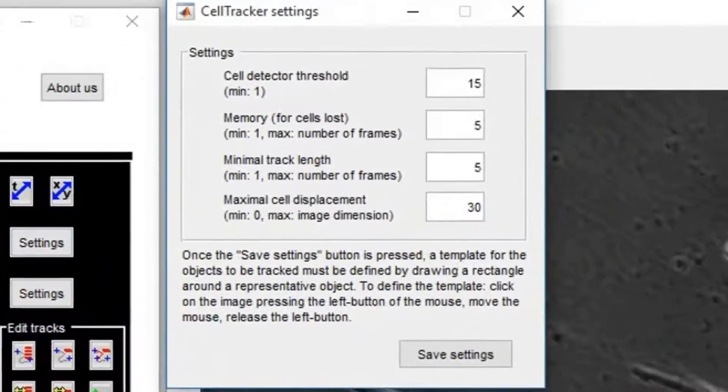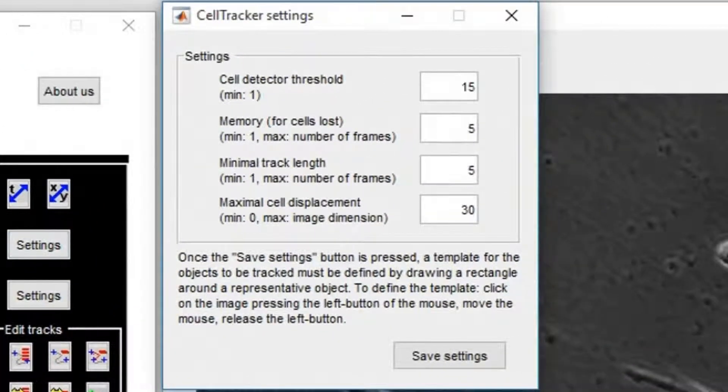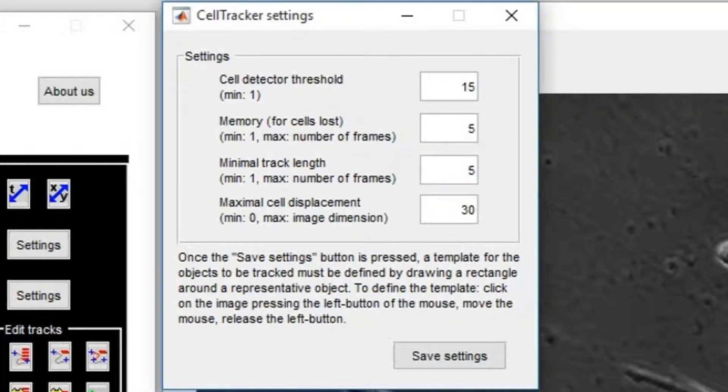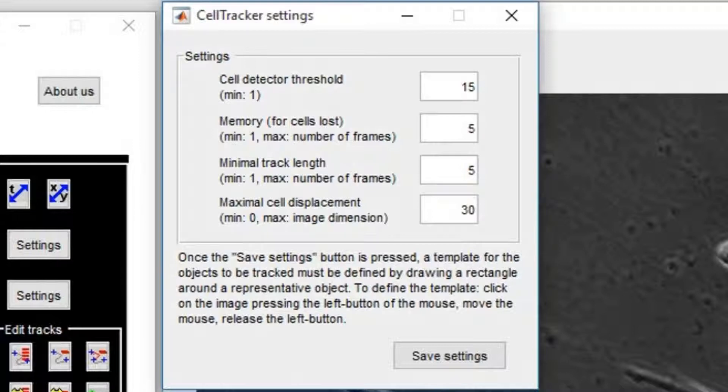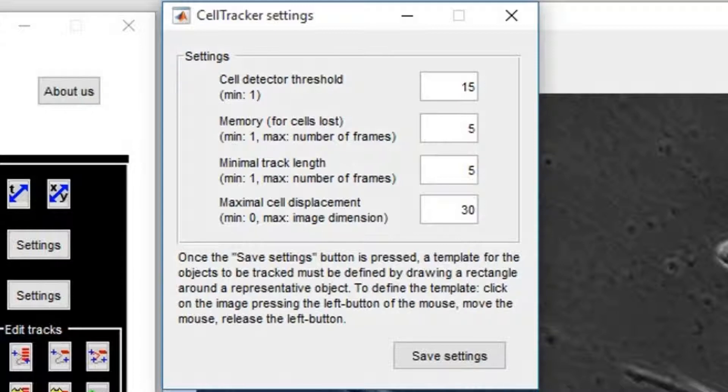When the button Automatic Tracking is pressed, some parameters are required. The first is Cell Detector Threshold. A few attempts are required to find a good value for this parameter. If it is set too high, the cells will not be detected. If it is too low, a lot of debris will be considered as cells.